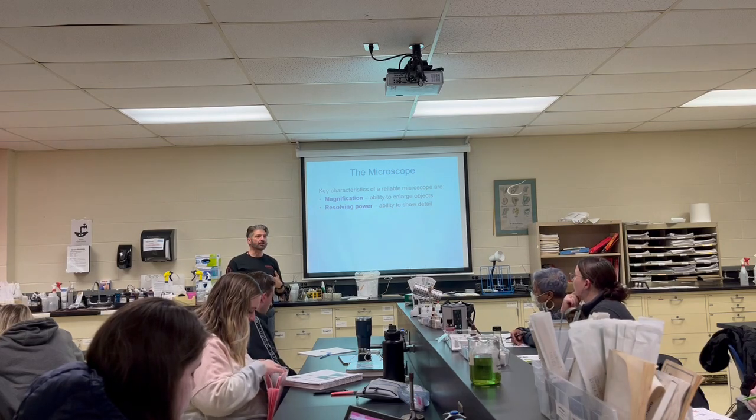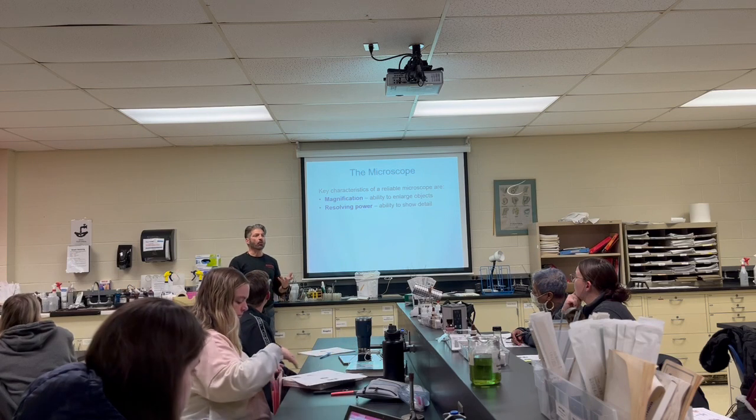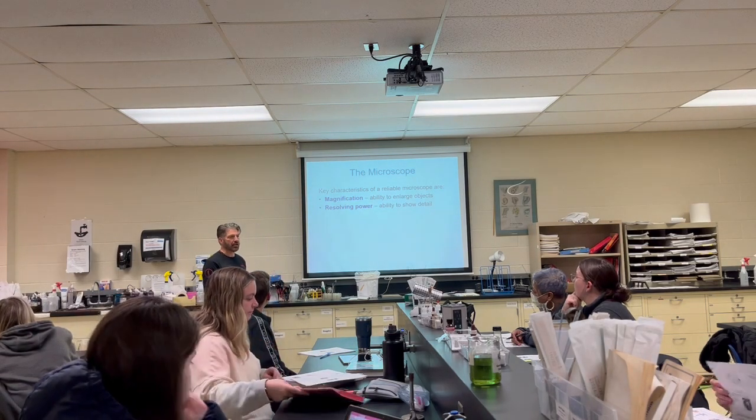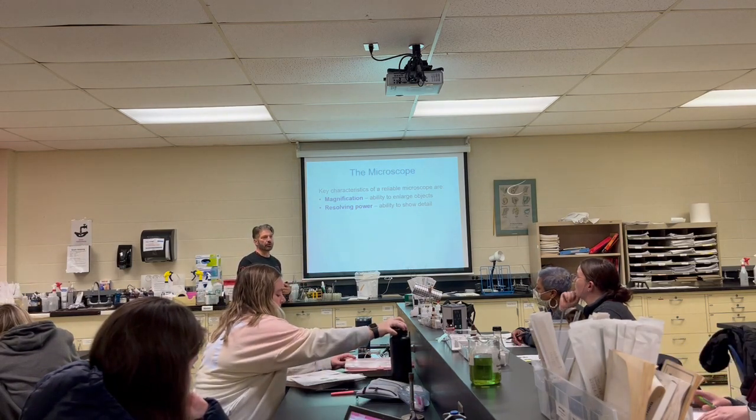On your lab practical, I will literally have a microscope probably over here with parts labeled. So just tell me, it's the ocular, it's the objective, it's the stage, what does it do? Those should be easy points for you.